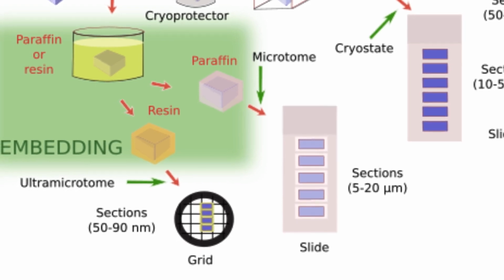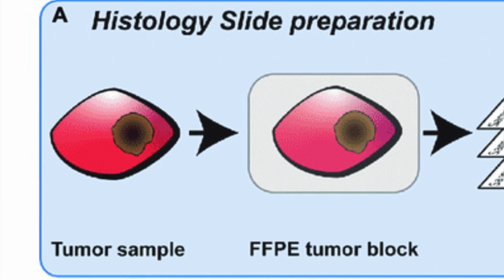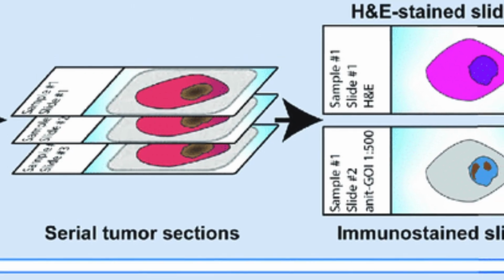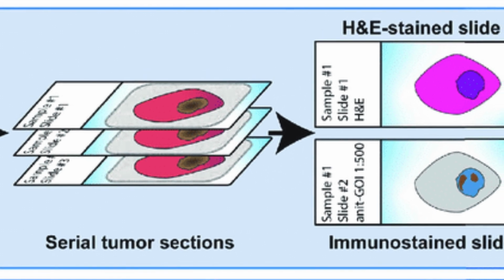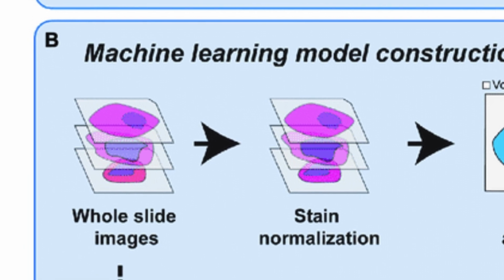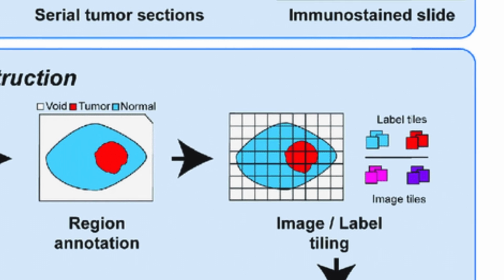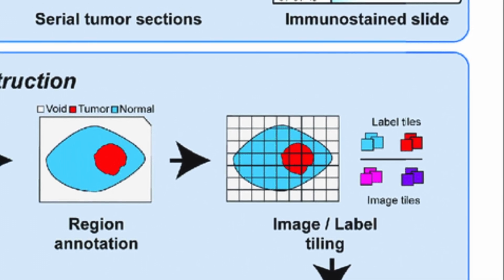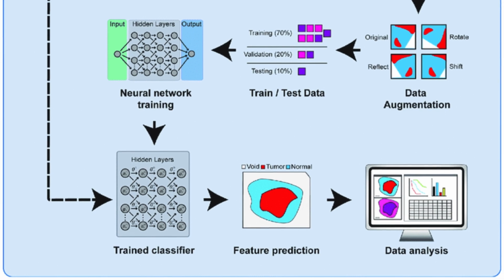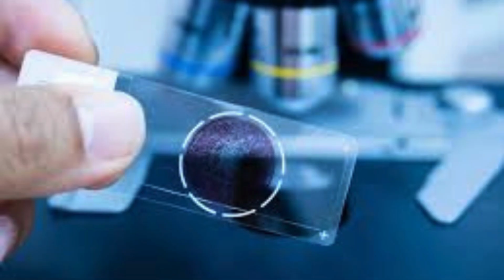Specific affinity to cellular structures. Depending on their charge, solubility, and molecular size, dyes may have affinity to certain cellular structures. For instance, the negatively charged phosphate group has affinity to hematoxylin, thus binding nucleic acids. Differential staining. It is applicable in a situation where various regions of the tissue section are selectively stained using different stains. This feature enables the differentiation of tissues and cellular structures.